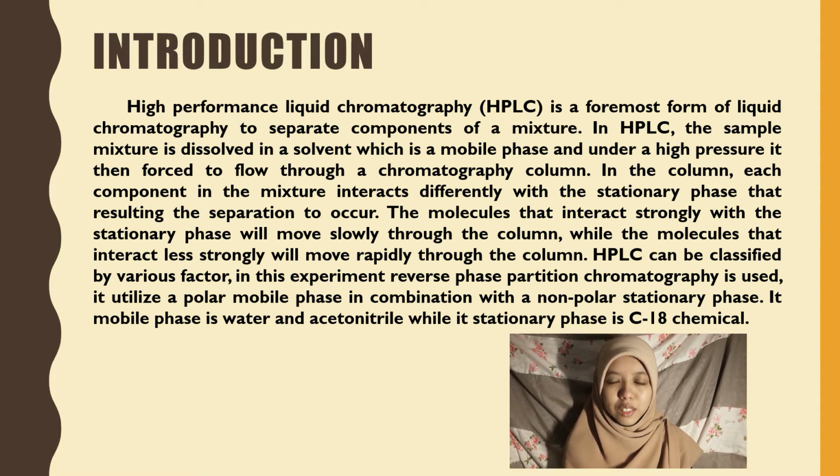The molecule that interacts strongly with the stationary phase will move slowly through the column, while the molecule that interacts less strongly will move rapidly through the column. High-performance liquid chromatography can be classified by various factors. In this experiment, reverse phase partition chromatography is used.